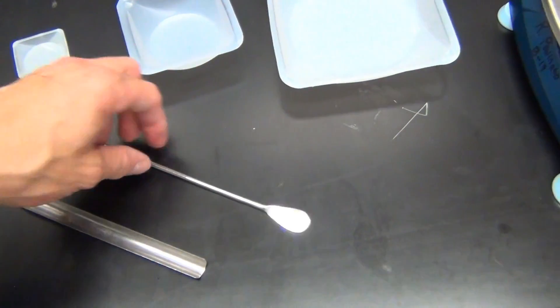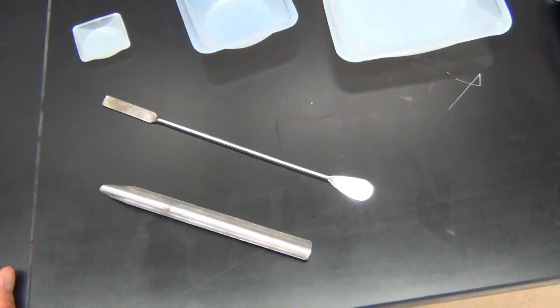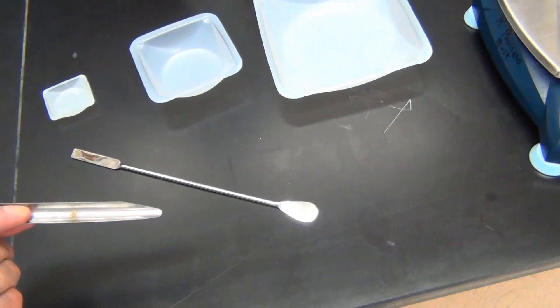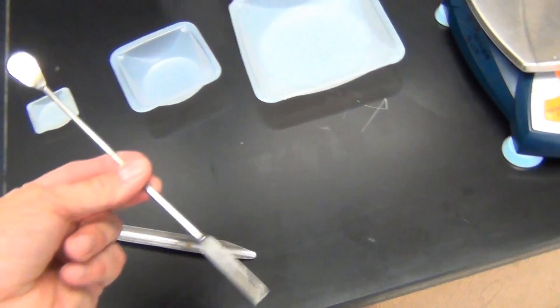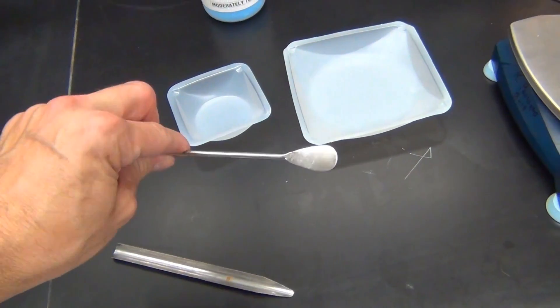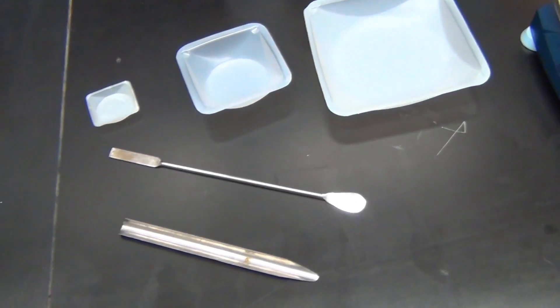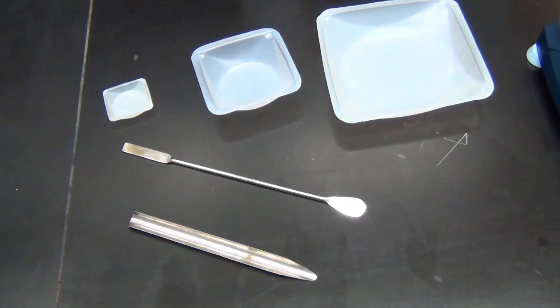These two pieces of equipment here are called scoopulas. One is a scoopula, one is a little bit more of a spatula, a micro scoopula, where it gives you a little bit more control as to the amount of chemicals. You will see both demonstrated here today.